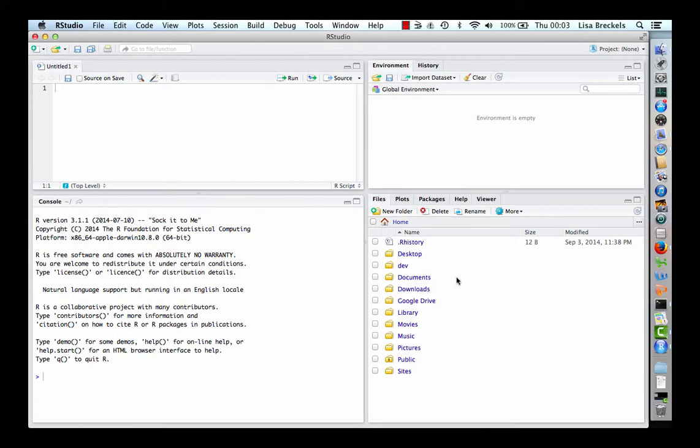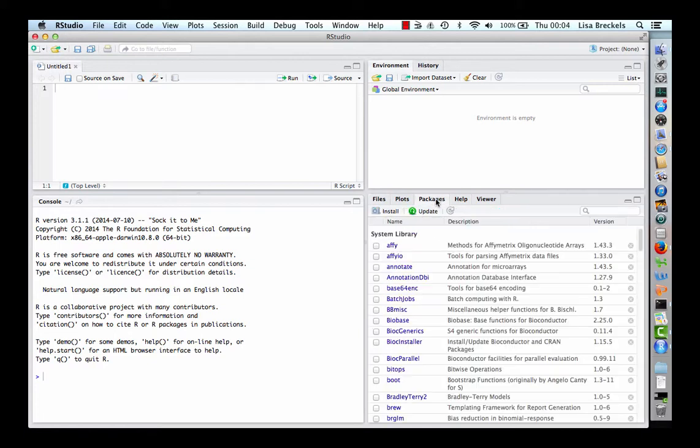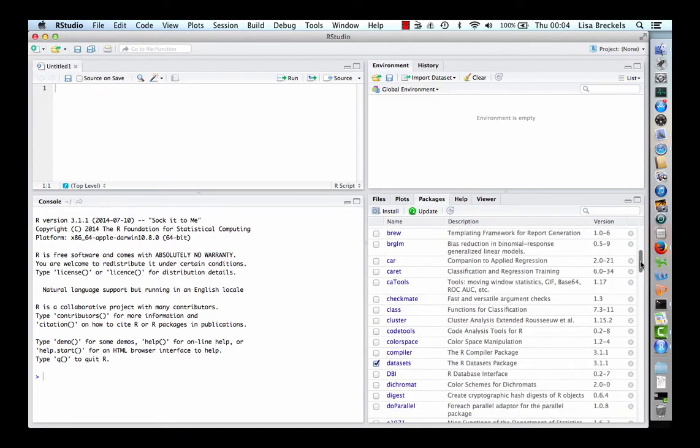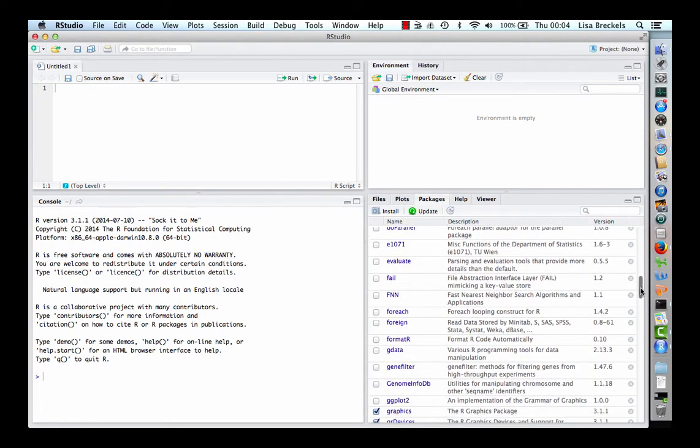Upon launching R, a number of base packages are loaded. If we click on the packages tab, these are the ones which are highlighted by a tick.